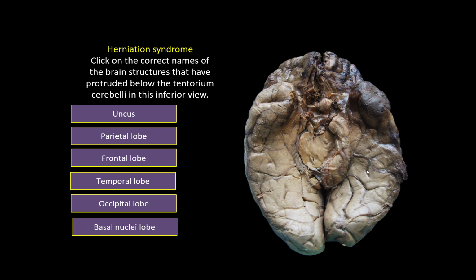And you can see how this side is very damaged, and actually there was a hemorrhagic stroke up here, and so that pressure of the bleeding pushed the downward force, caused this uncal and central herniation of the brain. So you can see how it is usually not just one thing that you see, but you'll see a kind of a cause or a reason, unless the whole brain overall is just edematous. And you see how closely packed in these gyri are, and they're very flat because this brain was edematous, had a lot of edema.